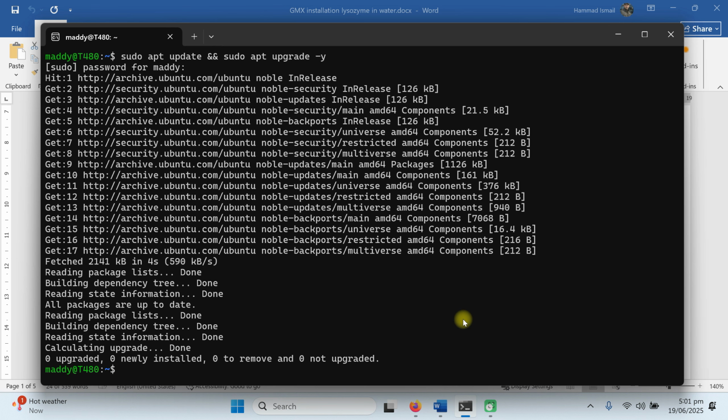We have explained all these steps in detail in our previous videos. If you need to watch the step-by-step installation, you can watch that relevant video. In this tutorial, we will only briefly explain. However, all these commands will be available in our YouTube tutorial description for your reference. You can simply copy, paste and run the files.